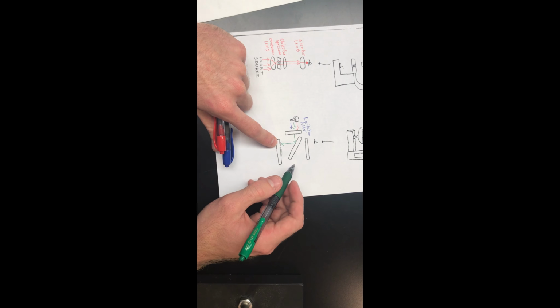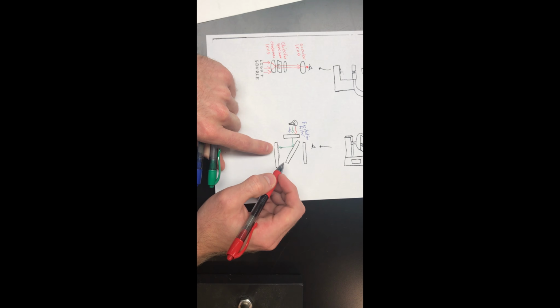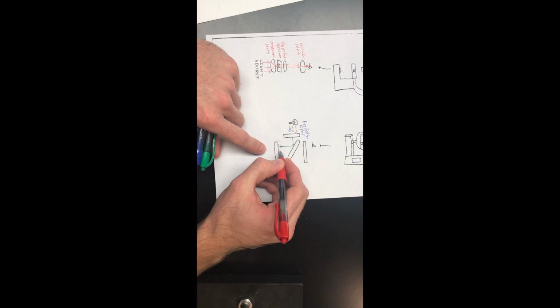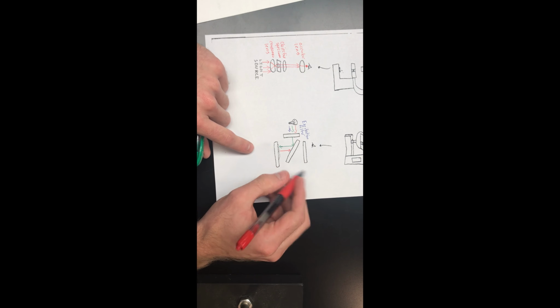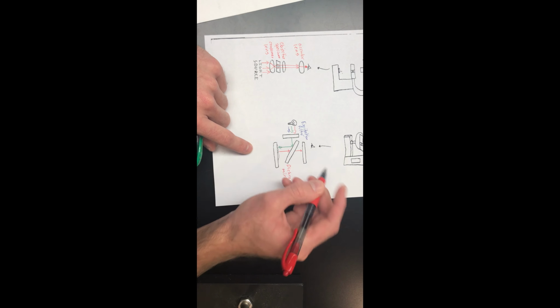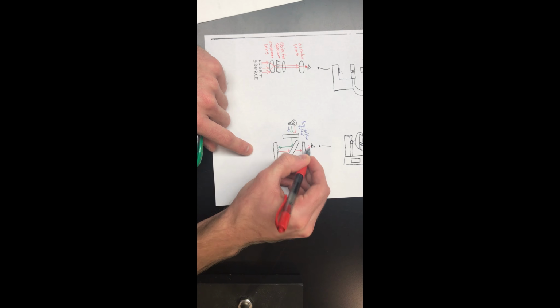When it hits the specimen, it's exciting the fluorophores, and then they're emitting light at a lower frequency, so there's less energy in the light. It's going to pass through the dichroic mirror, and then it will also pass through the emission filter. That is the image that the viewer is observing.